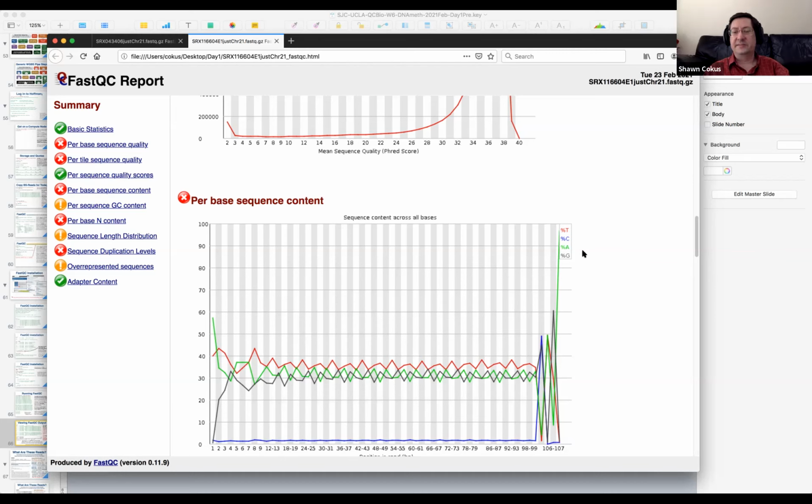Because the uniqueness is more. Uniqueness usually goes through a phase change, right? So if you look at k-mers of size 1, obviously that's a single ACGT. That's as not unique as it gets, right? And then you go up to 10-mers. Well, 10-mers are everywhere, right? There's only so many different 10-mers, 4 to the 10. But by the time you get up to 20, 30, now there's supposed to be a phase change, and you go from basically no k-mer unique to almost all of them unique, right? And the transition zone usually isn't very wide.